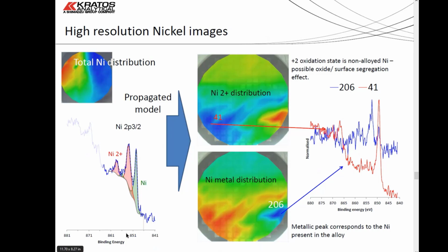So these were relatively quick spectra. I'm thinking around about a minute or 2 minutes. These are low concentration. Nickel's quite a low concentration element for this material, but these experiments are hours, not days. That's what I'm trying to get across.